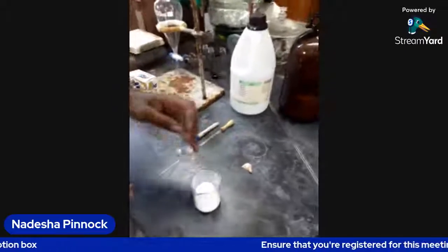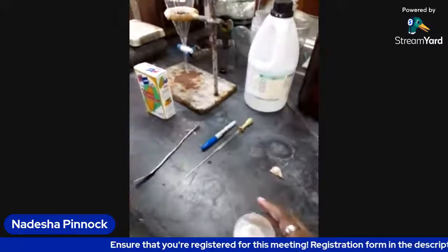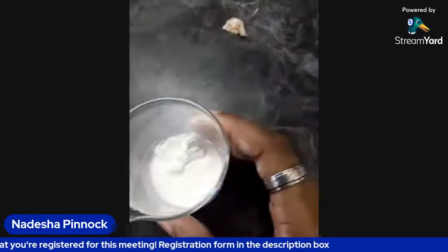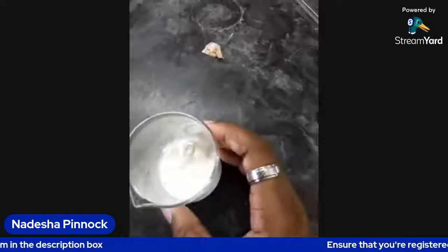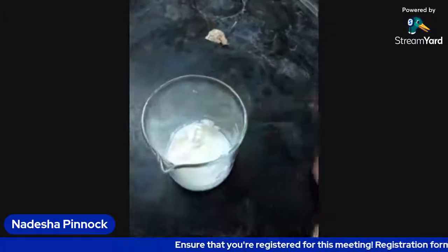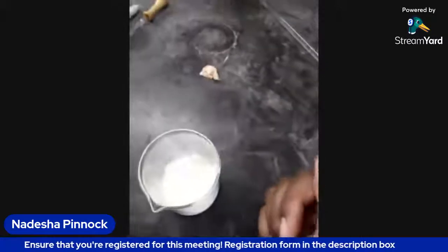We're adding, remember, we would need some more water. And as we added it, you can see a little bit of fizzing, not much. And the solution, or the suspension rather, is milky white. You probably add 10, 20 mL actually.